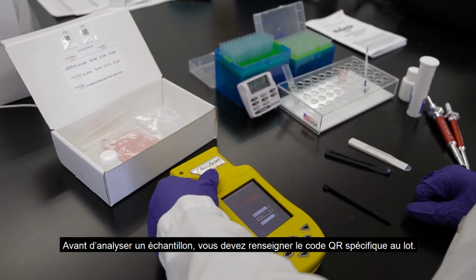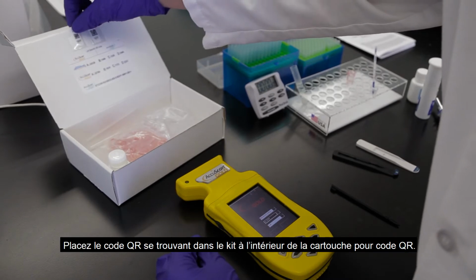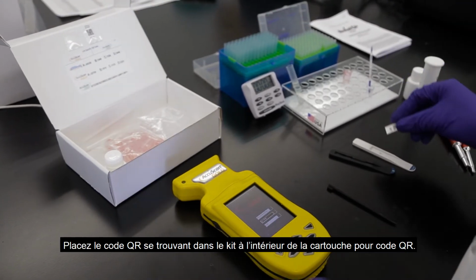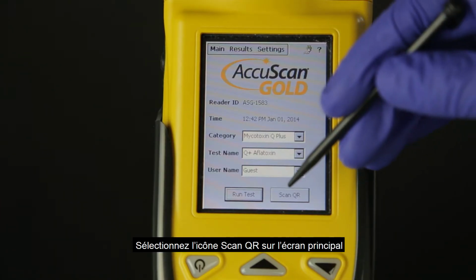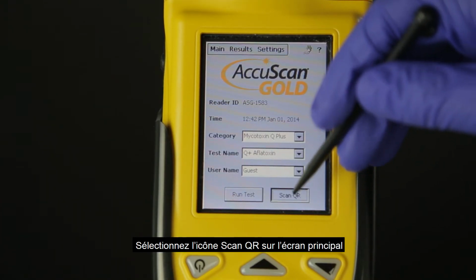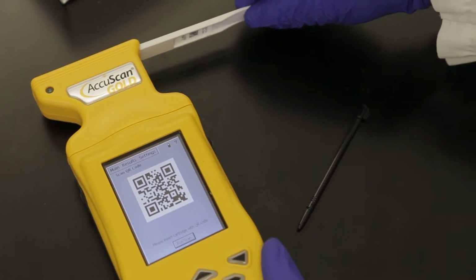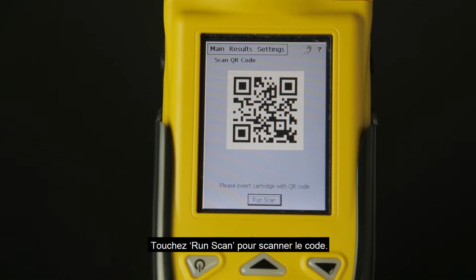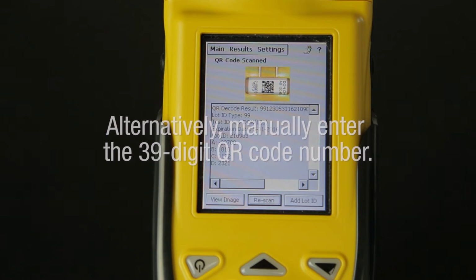Prior to running a sample, you must enter the lot-specific QR code. To do this, place the disposable QR code contained in the kit into the QR code cartridge. Select the Scan QR code icon from the home screen and place the QR code cartridge in the reader. To scan the code, touch Run Scan. The specific information is automatically downloaded into the reader.